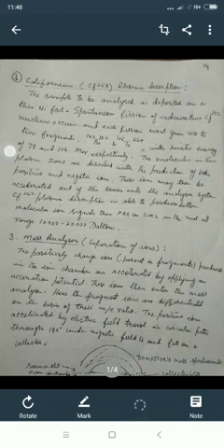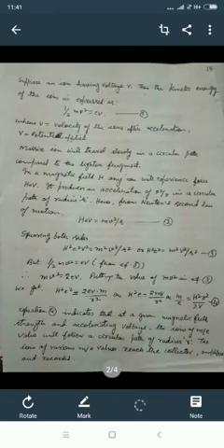The positive ions accelerated by the electric field travel in a circular path through 180 degrees under the magnetic field H and fall on a collector. Basically it is the Dempster's mass spectrometer, which has a curvature, and on the curvature separation of m/e fragments takes place.